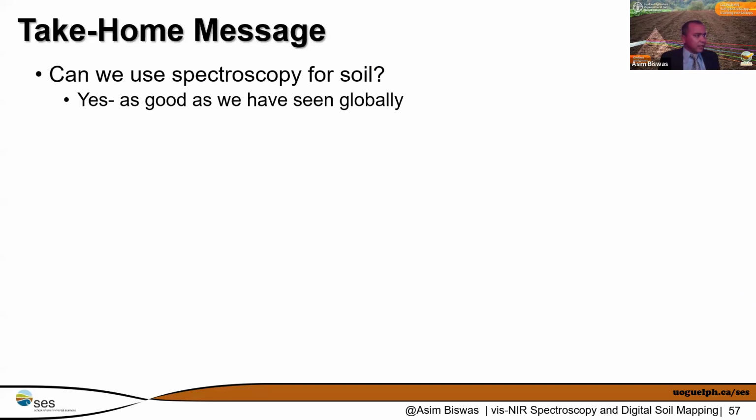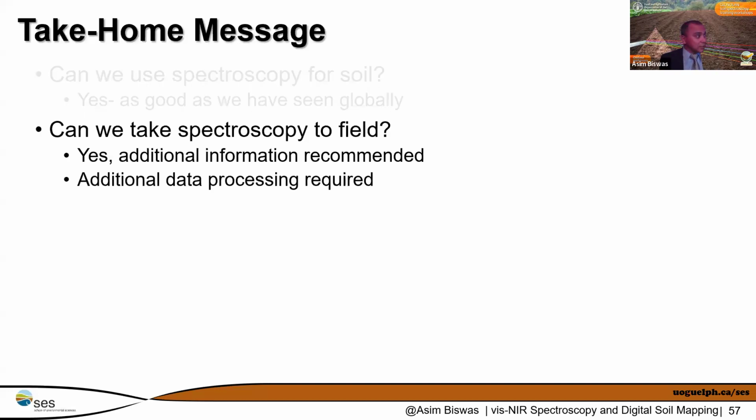I just want to check: I put a couple of questions at the beginning. Can we use spectroscopy for soil? I would say yes, as good as we have seen globally in many, many research studies. On this platform, we have heard from many globally recognized scientists and their research, and our research is showing very similar progress as well. So yes, it is as good as we can do.